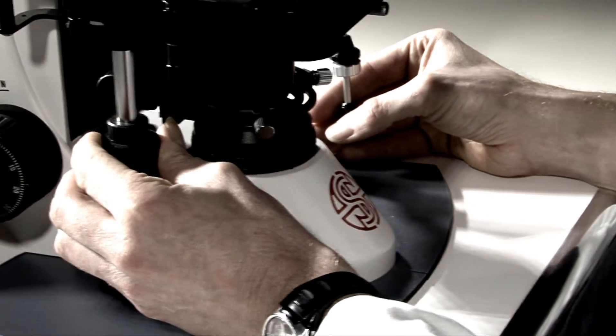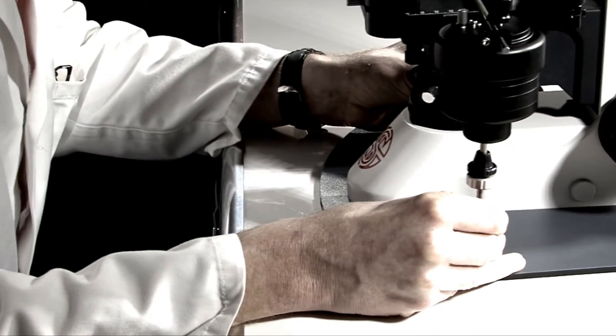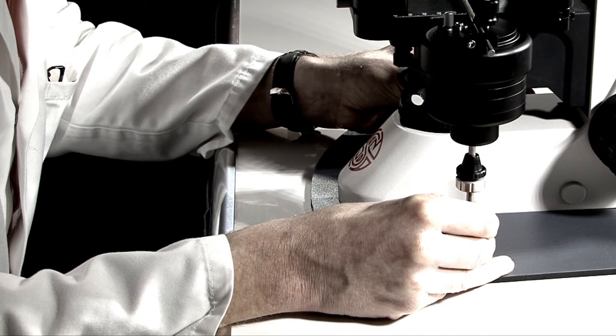Benchtop operation for extended comfort. A single joystick for X, Y and Z needle control.